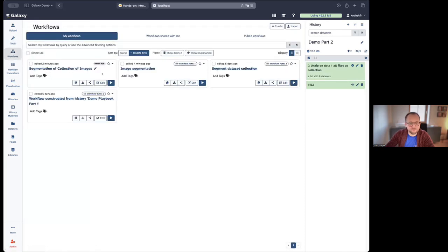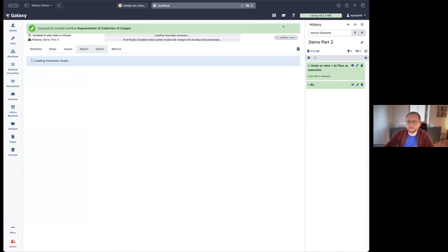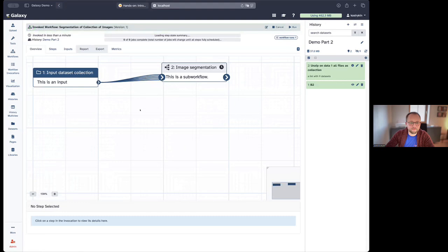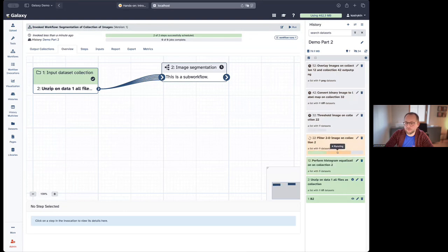And then I can run the workflow that I just created. This was this here, segmentation of collection of images. Let's run this on the result of the unzip operation. And here we can again follow how the individual tasks of the individual steps of the segmentation workflow are queued and executed consecutively, one after another.